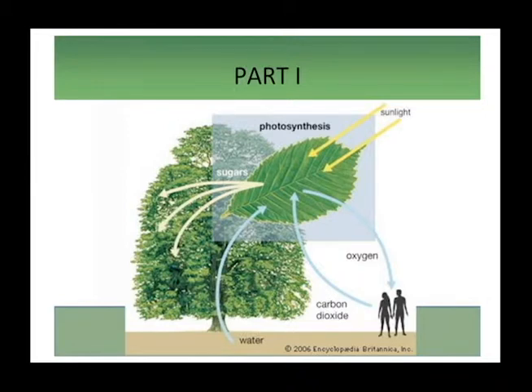Photosynthesis is a critical component of the global carbon cycle, and it is responsible for providing energy to many of Earth's organisms. Because of the importance of photosynthesis and because rates and strategies vary across plant types, the ability to accurately measure photosynthesis is increasingly important. This webinar will present and review current research involving the CI340 handheld photosynthesis system, highlighting unique and innovative uses in the measurement of leaf level dynamics.